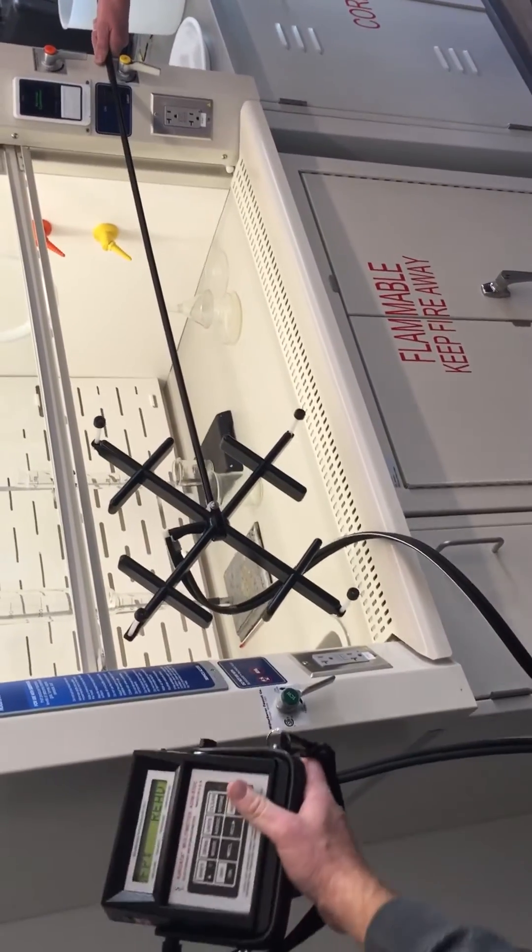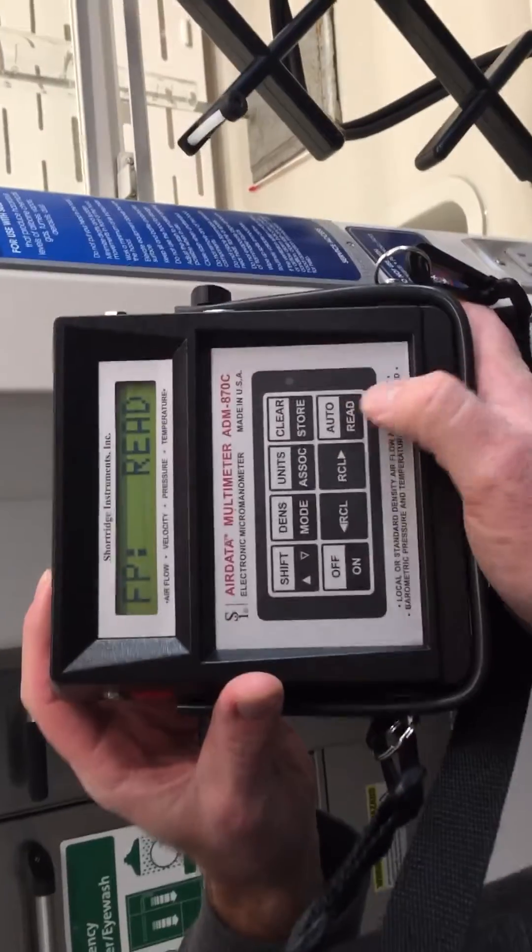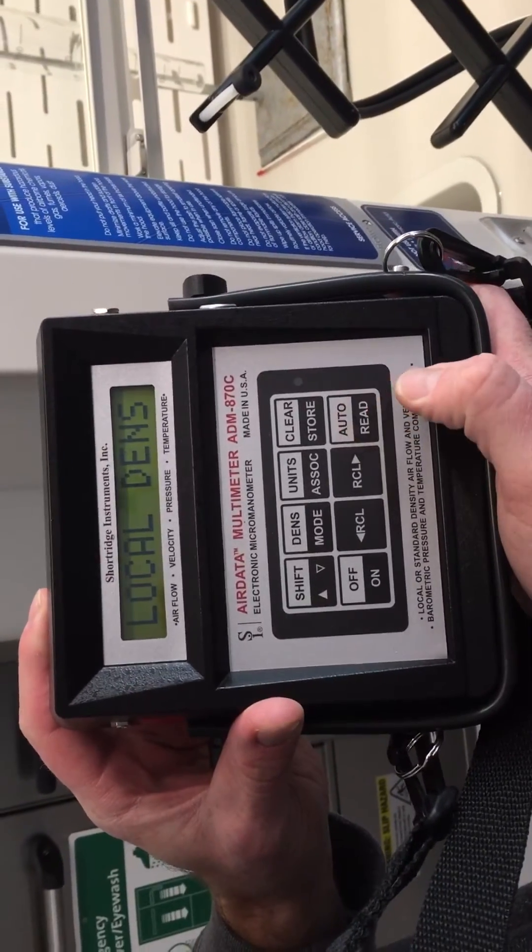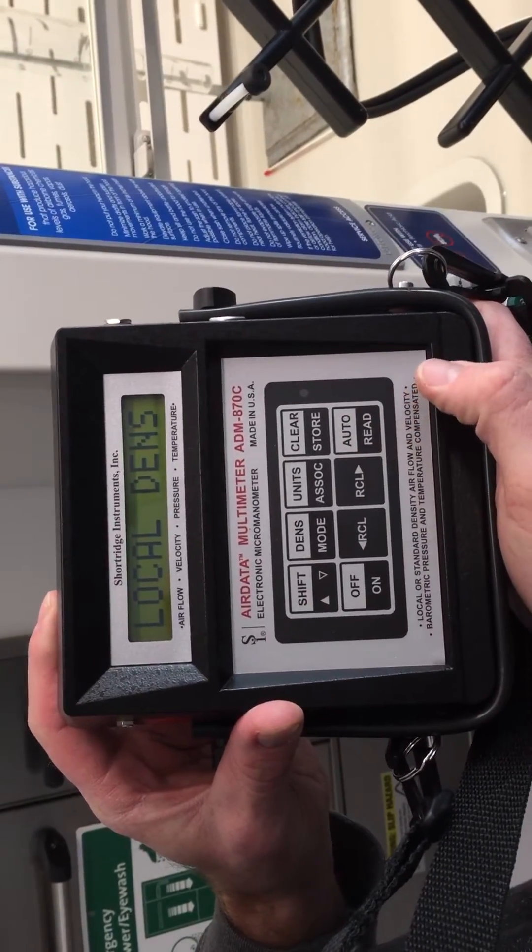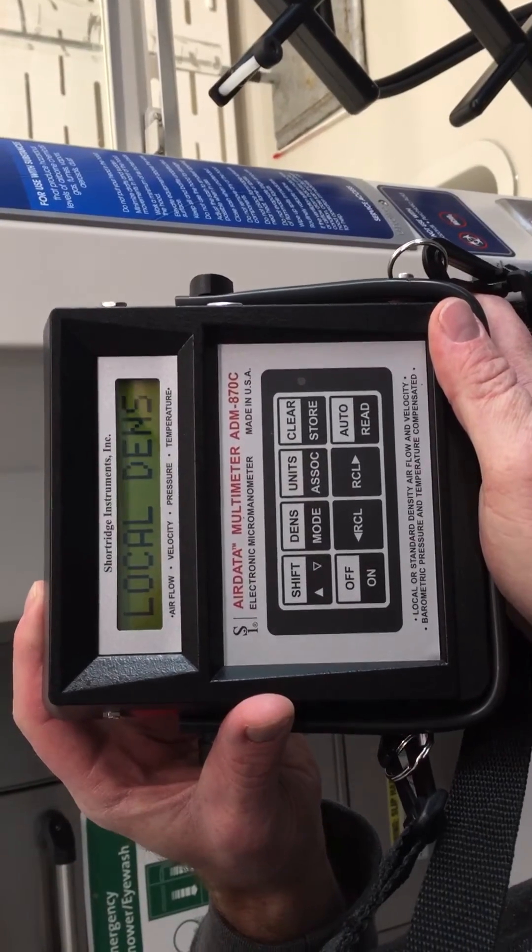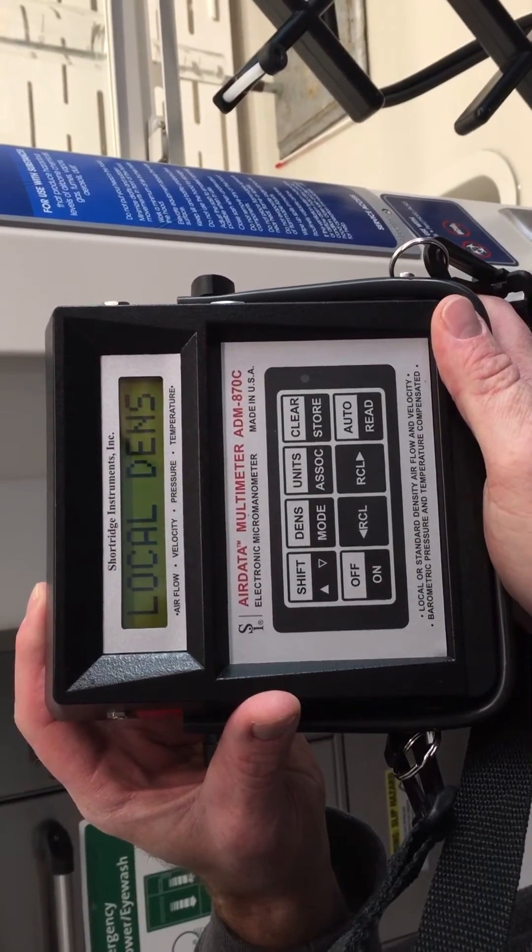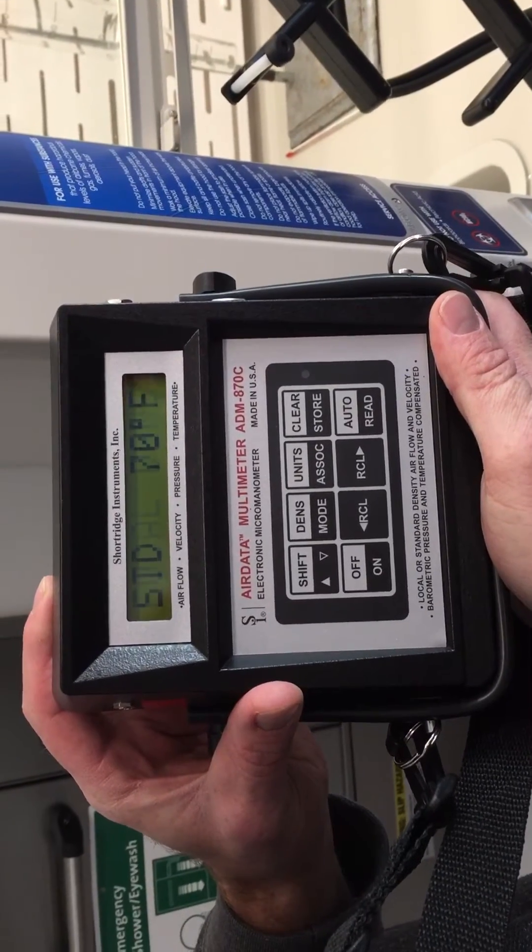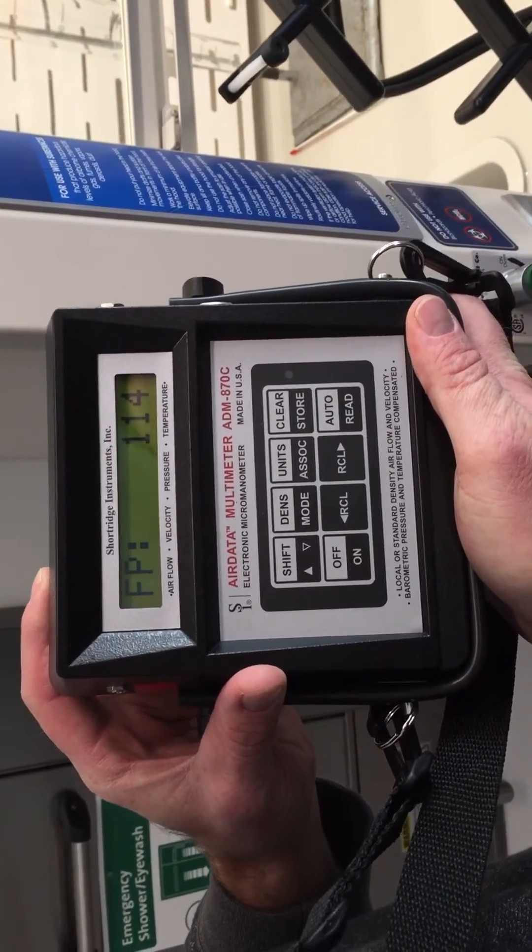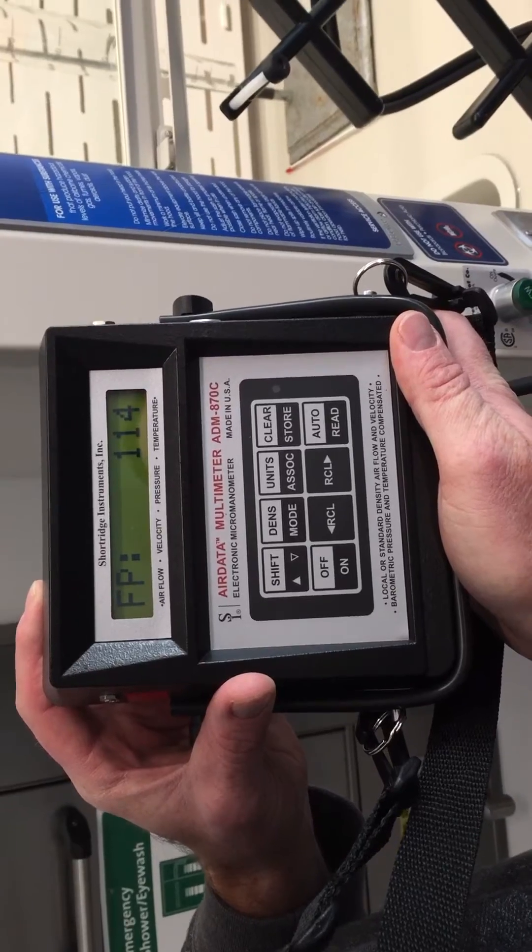You then, on the terminal, press the run button to take a measurement of the air flow. This reads as 114 feet per minute.